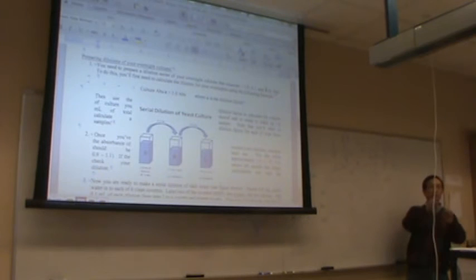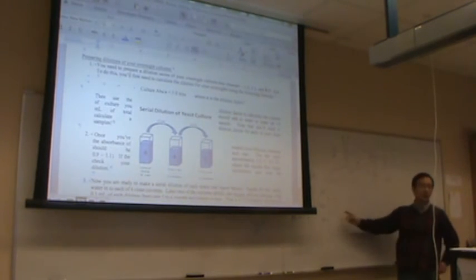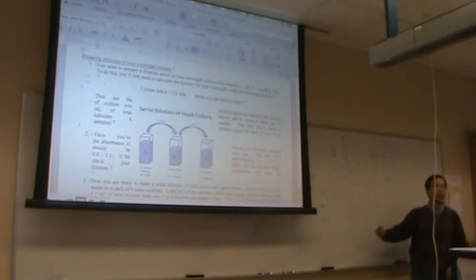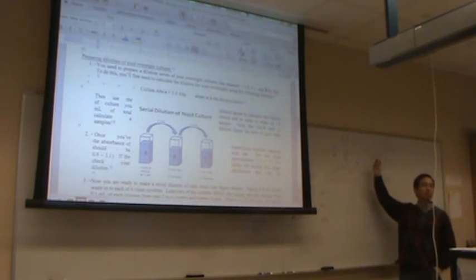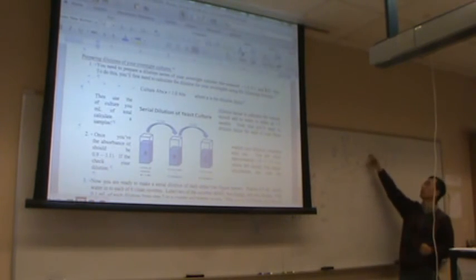Do we need to mix it or centrifuge it? Each sample is in a separate tube. We're not mixing those things now. I was just asking, do you want us to shake those small ones so that the solution and the water are mixed together, making sure the cells all go through the water? So basically the cells are resuspended in the liquid.